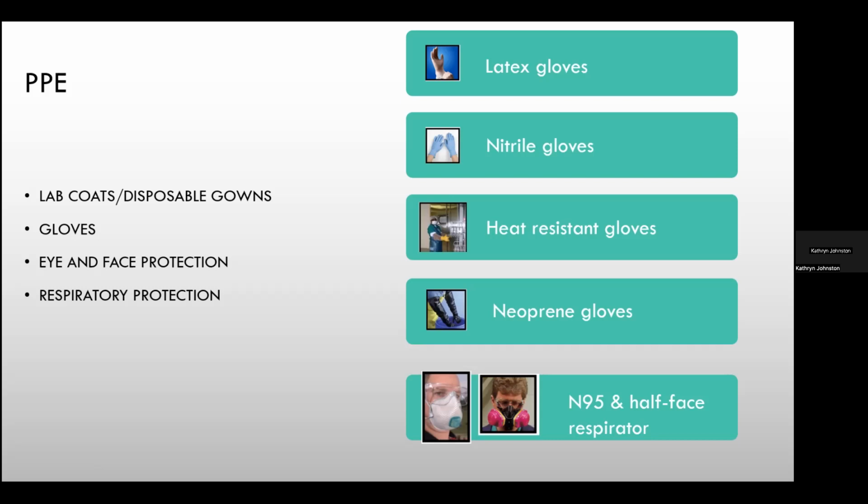It's really important that lab coats, it's not one size fits all, not one type is appropriate for every situation within the laboratory. So lab coats are available in a variety of materials, and those materials provide varying degrees of protection. So you've got splash resistant coats, static free coats, chemical resistant coats, flame resistant coats.